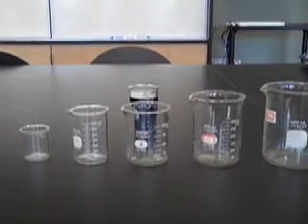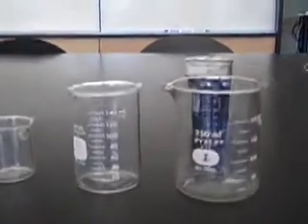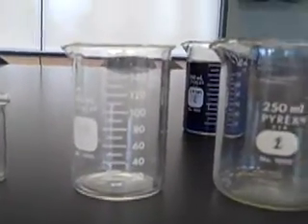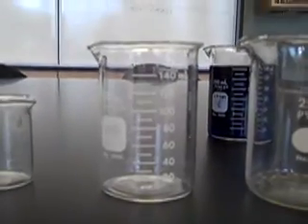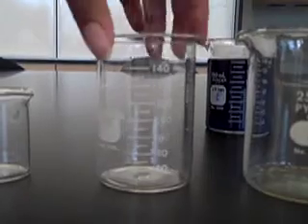If you're only measuring 100 milliliters of liquid, use the 150 milliliter beaker, not the 600 milliliter. Since beakers have a lip, they are useful for pouring after measuring.